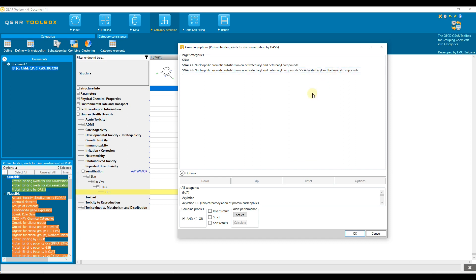The search for analogs is based on the profiling result of our target chemical. There are additional options below that allow you to control how the analogs are searched. In the combined profiles section, the user can select how to combine the profile results of the target chemical with the logical operations AND or OR. AND means that all the profile results listed above must be included in the chemicals searched for. If OR is selected, it is sufficient if only one of the listed profiling results is found in the searched chemicals.